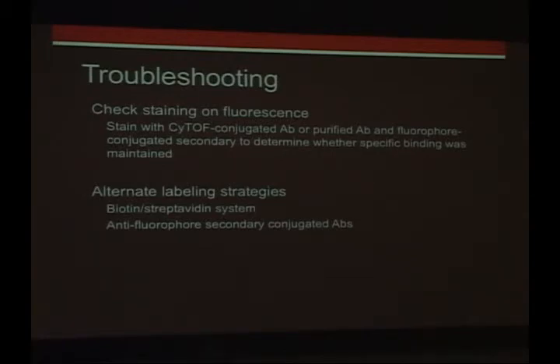If your signal does look really similar on a fluorescence-based flow cytometer, then what probably happened is you either forgot to add the metal, or the chelation didn't happen properly. I would just go ahead and relabel that antibody because it really should work.